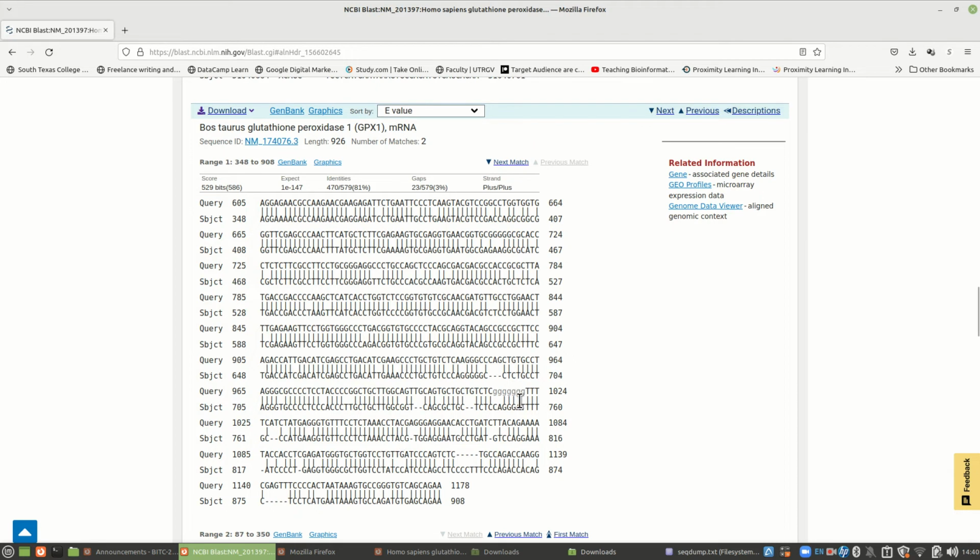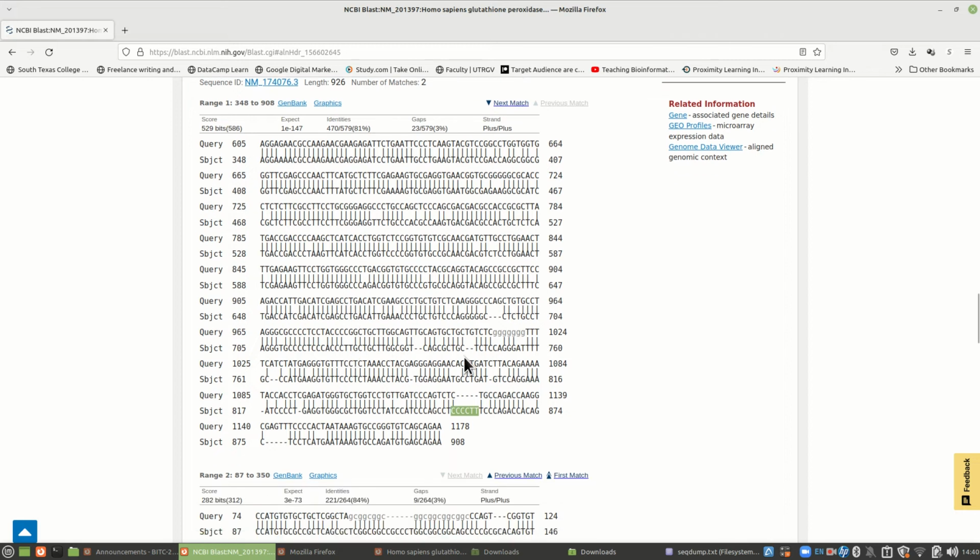There are quite a few mutations in here. And what you would tell me is that, hey, there are lots of places where there are just places that are missing. Look at this, here and here. Now, in a later analysis, when we move on to the later part of the class, we are going to grab that sequence there, and look up and see if that sequence that was added or taken away has particular function in biology. Now, we're not going to do that on this one. On this one, all I want you to do is notice things like that.